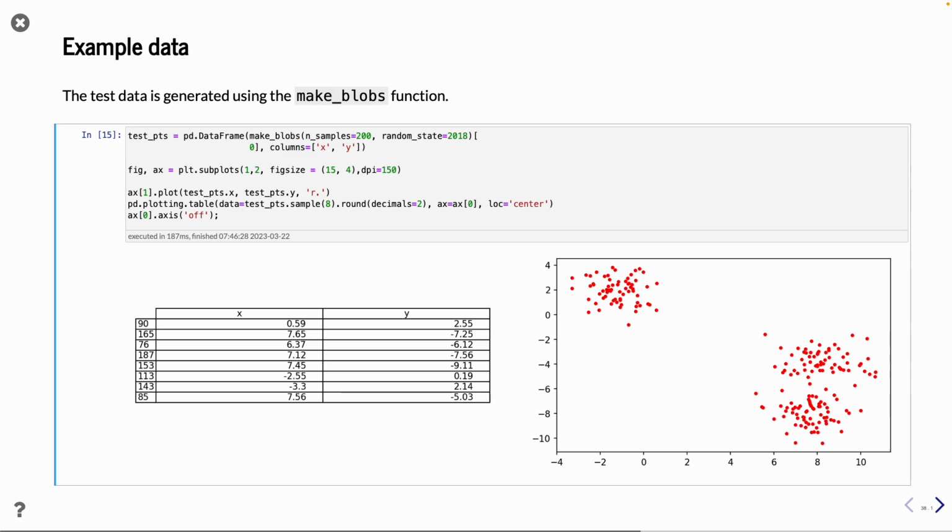And these dots here, you can see them in this case as a two-dimensional histogram, a bivariate histogram. And that is something you can use also with any number of dimensions. This clustering technique will find nice centroids of each cluster.